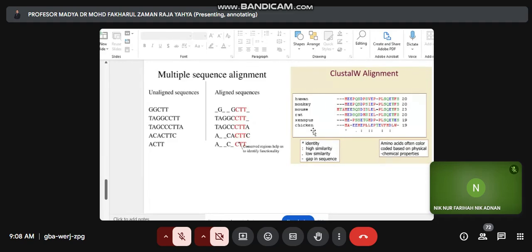across these different species: human, monkey, mouse, rat, xenopus, and chicken. The same goes to other amino residues. If particular amino residues are completely conserved in this multiple sequence alignment, meaning that the score value is highest. If less conserved, as indicated by double dot and single dot, the score value for these amino residues in multiple sequence alignment is lower than that of star symbol.